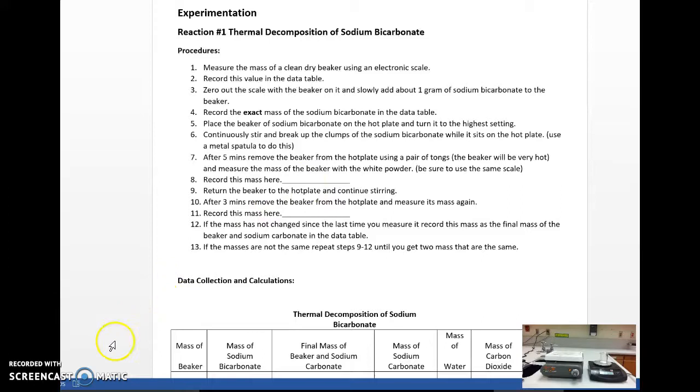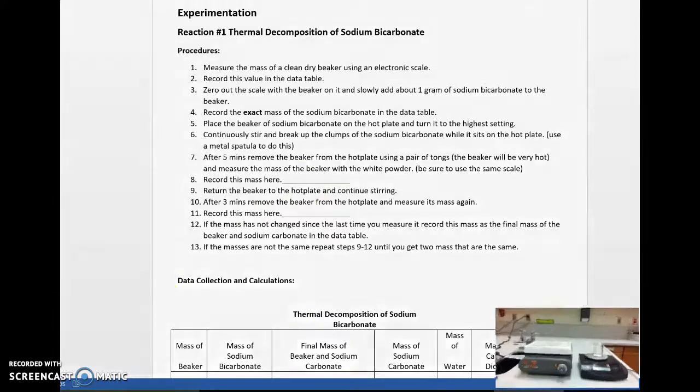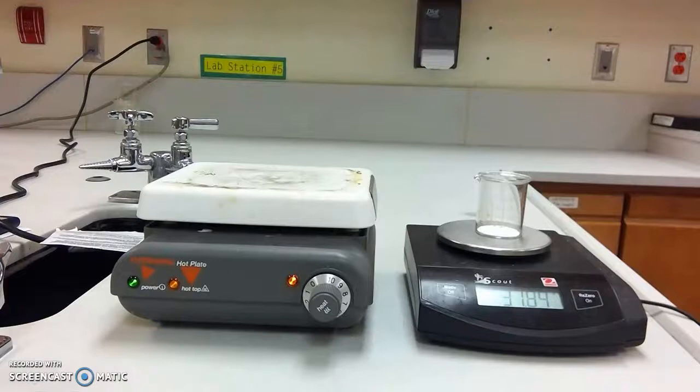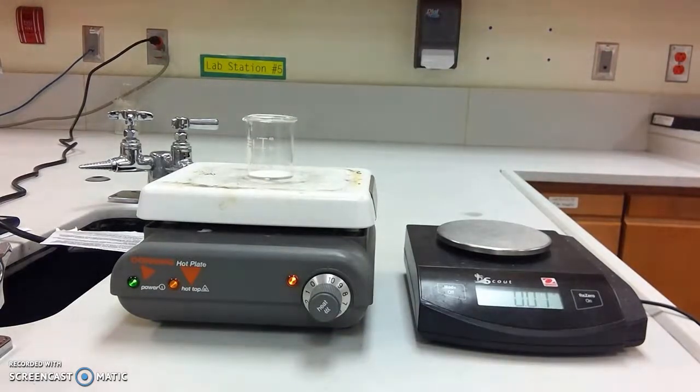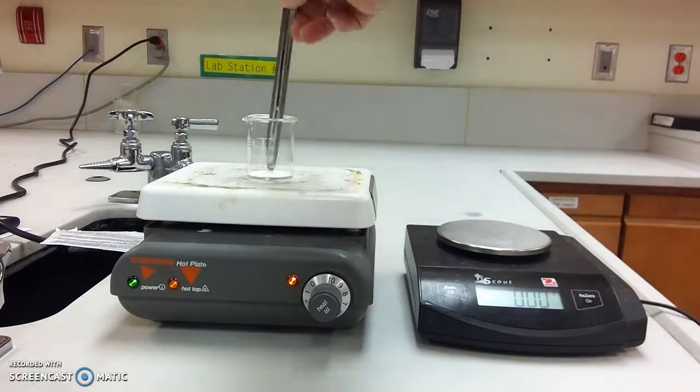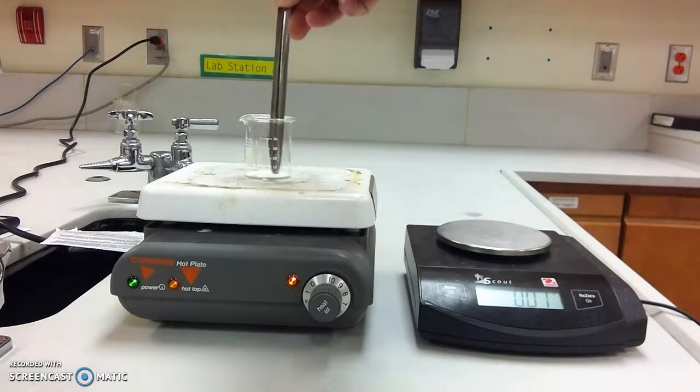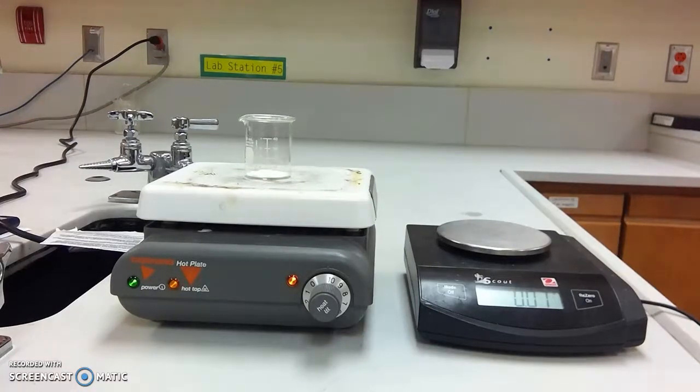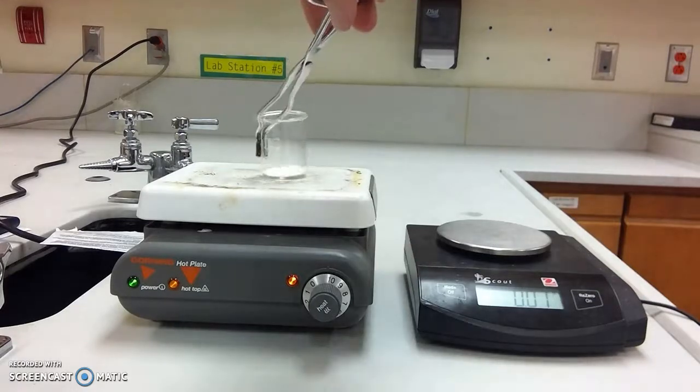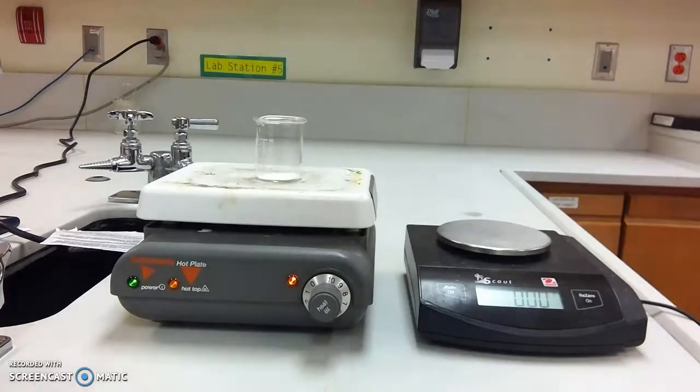Then I'm going to take that beaker. I'm going to then return it to the hot plate and continue stirring and breaking up clumps for an additional three minutes. And what I'm trying to do here is I'm trying to get all of that sodium bicarbonate to go through that chemical reaction. I want all of that to go through that reaction. So I'm continuing stirring. Let's pause time here for a minute.